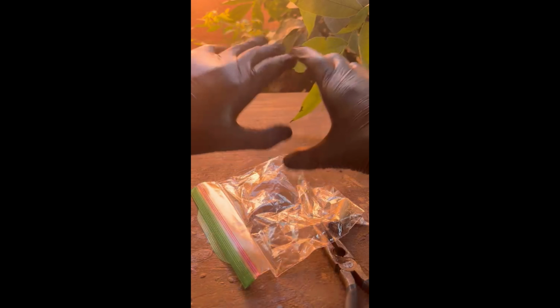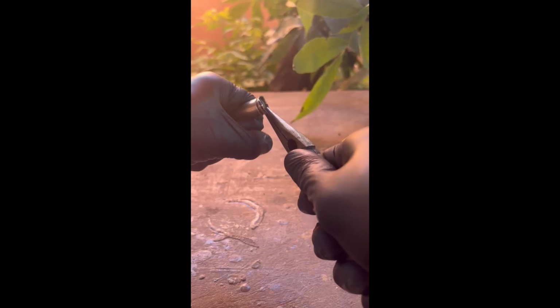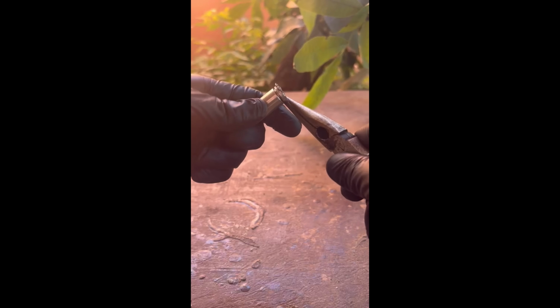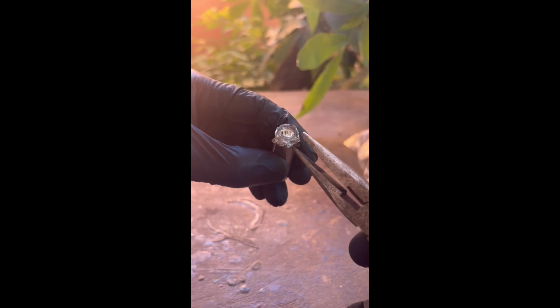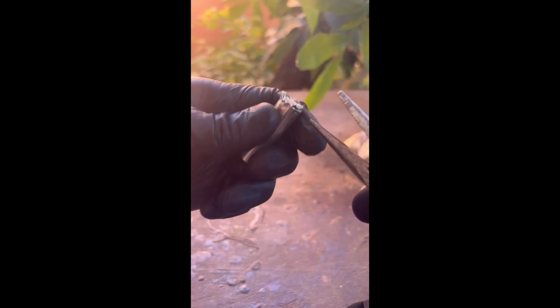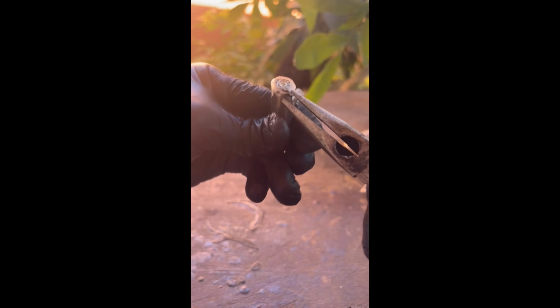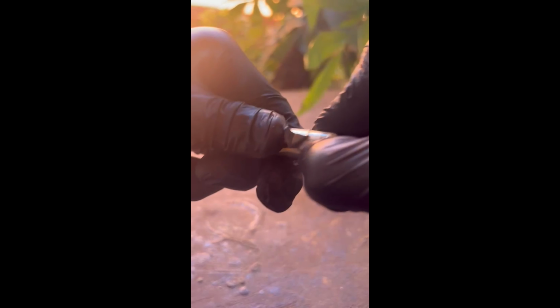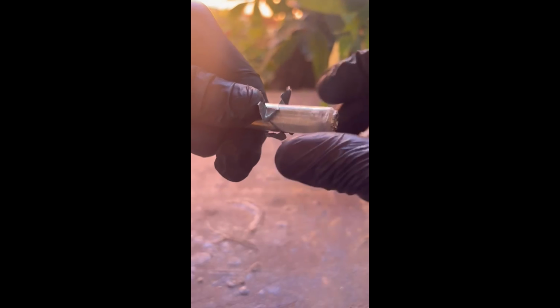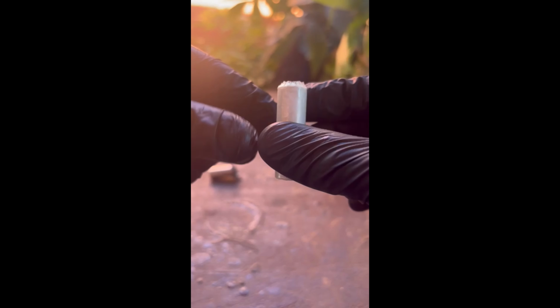From now on, the use of gloves is mandatory to avoid the touch of the skin directly to the chemicals present in the battery. The next step in the process is to take out the plastic bag inside the battery that contains the lithium metal. For this, I continued by using the needle nose pliers and basically just pulled the metal case off until the bag became easy to take out with my hands. It took a while, but I eventually ended up having this white plastic bag that contains the little metal I am searching for.